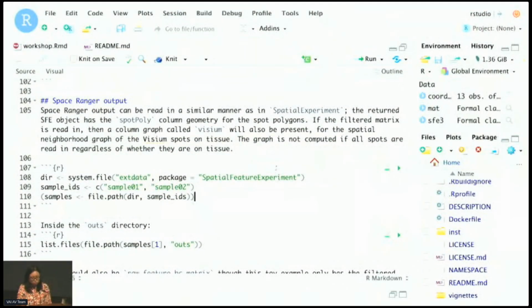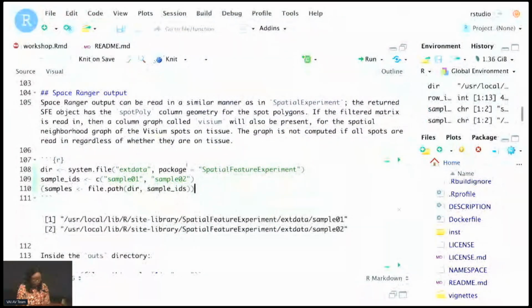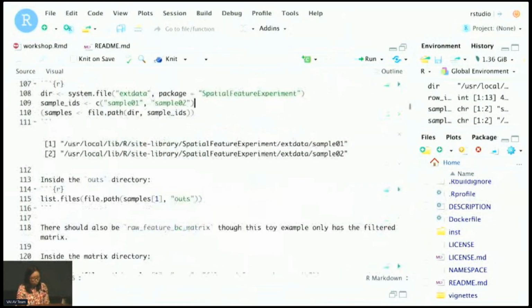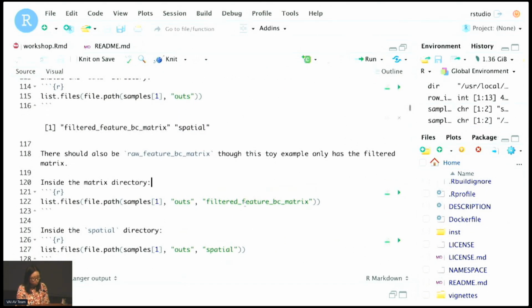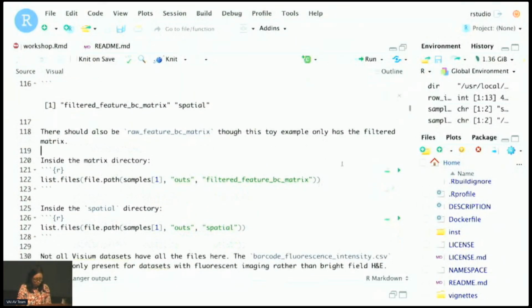So Visium is the most popular data collection technology, and Space Ranger is the official data preprocessing pipeline. So here, the SFE package comes with a toy example Space Ranger output for Visium. It's the old-fashioned Visium. So we have the gene count matrix and the spatial information, which includes the images and the spatial resolution of the images and so on.